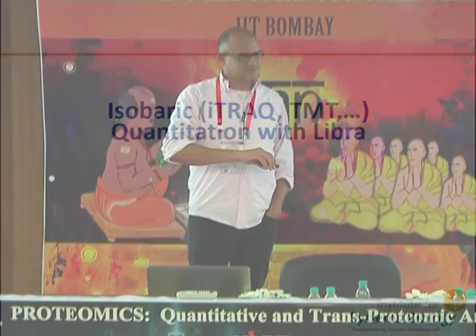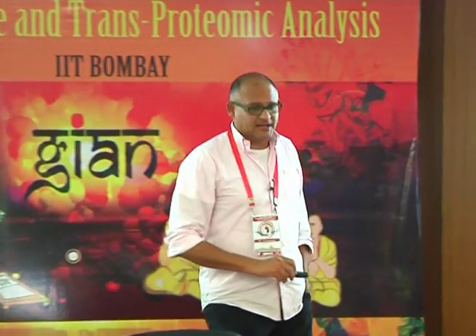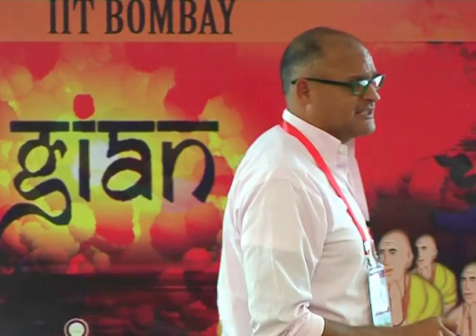Okay, so I just spent the last almost hour talking about isotopic labeling quantification. There's another way of quantifying, labeling your sample, and this we call isobaric labeling. These are techniques that you can use with reagents like iTRAQ and TMT.